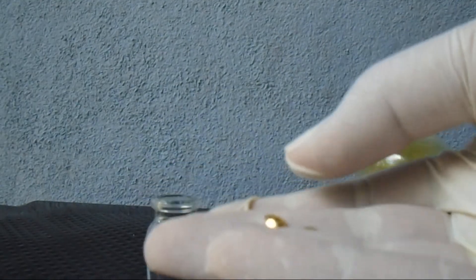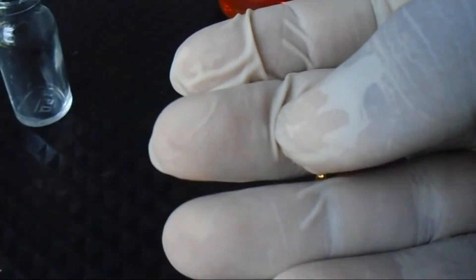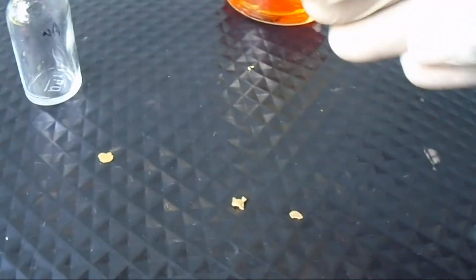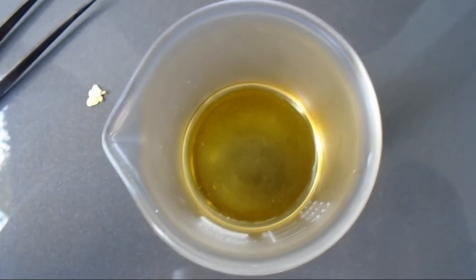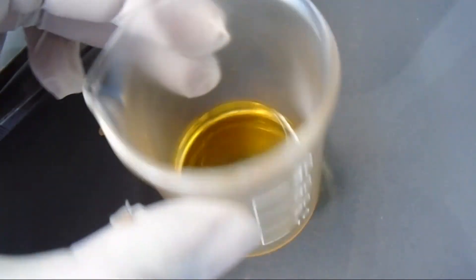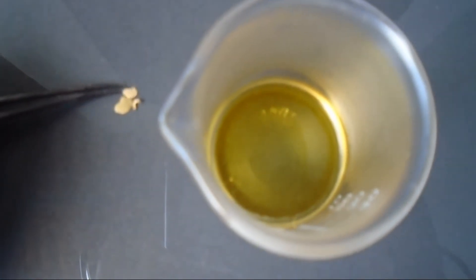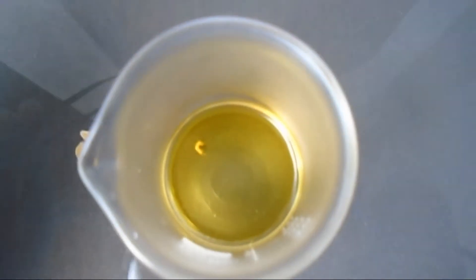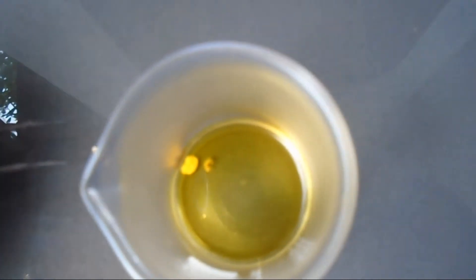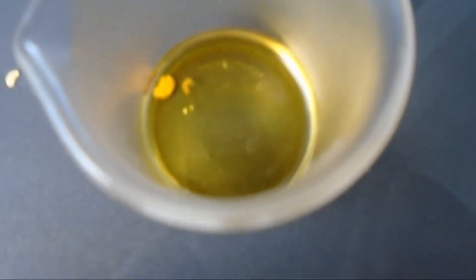Here it is my gold metal. Now here is a very tiny little piece of gold. Now I add this gold into the aqua regia solution.